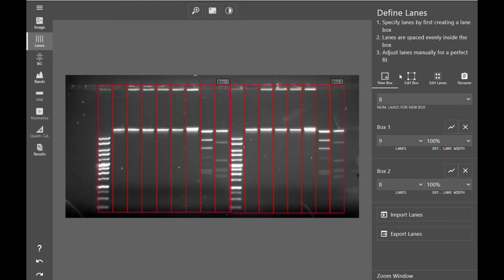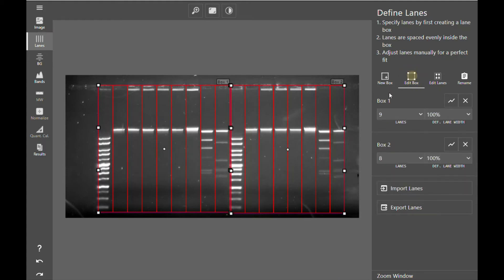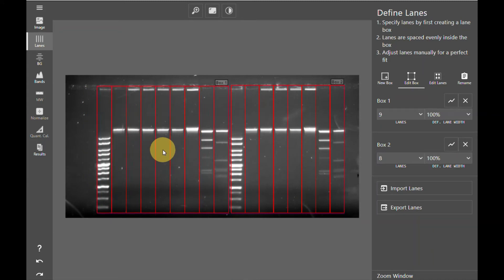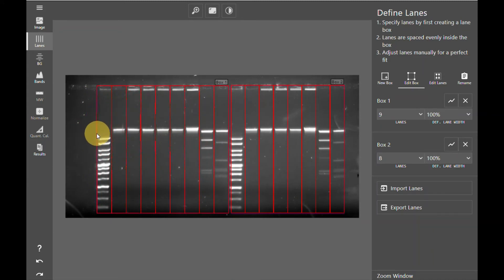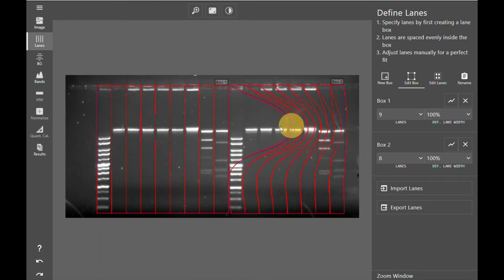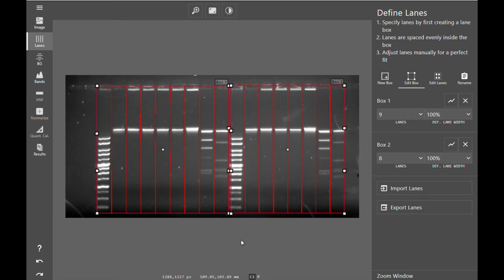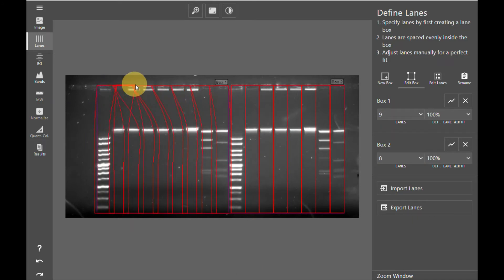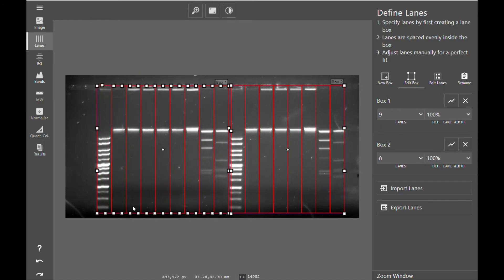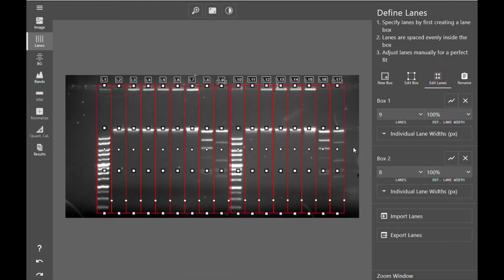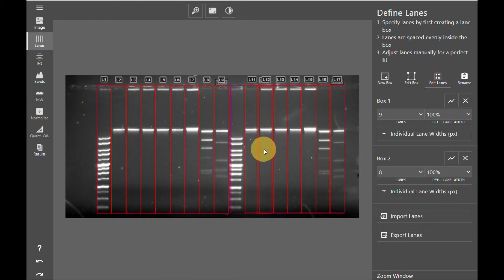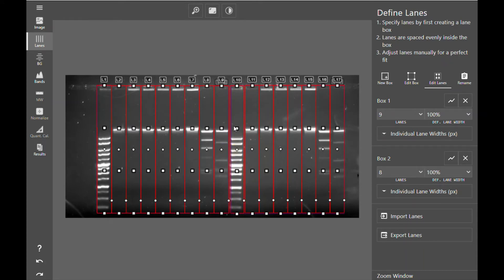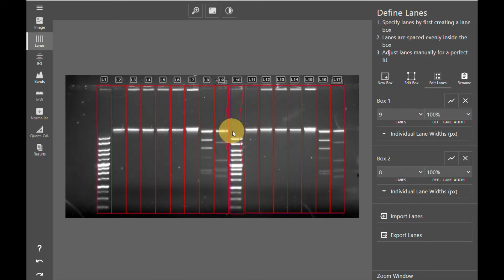I can now adjust and edit the lane boxes by using the diamonds to move and the squares to adjust and bend. You can see that I can manipulate them independent of one another. I can add additional divisions into each of my lane boxes in order to more finely tune the adjustments I make to my lane boxes. Or if I have an adjustment to make to an individual lane, I can edit lanes and again use the diamonds to move and the squares to bend and manipulate.